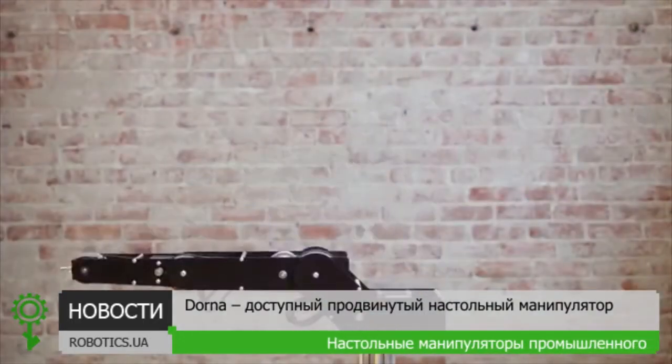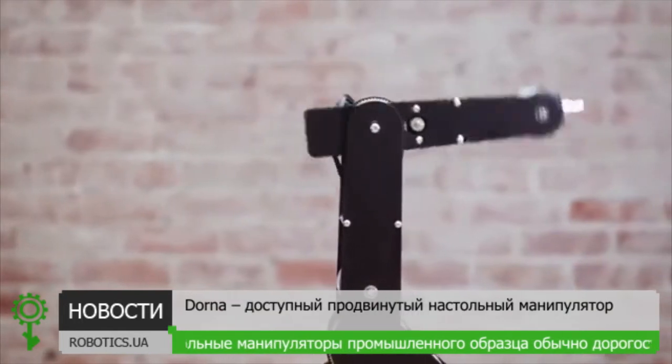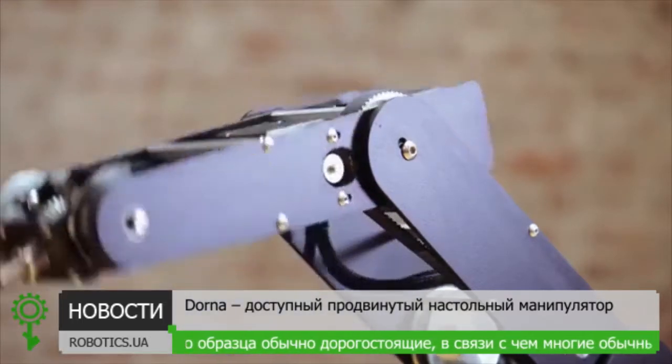Introducing Dorna, a 5-axis robotic arm. Dorna is a capable, versatile, and affordable robot with a simple and elegant design.